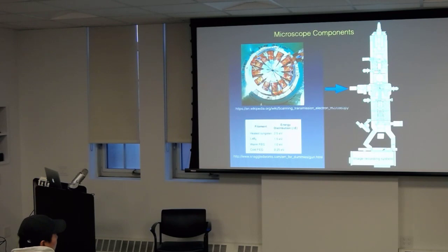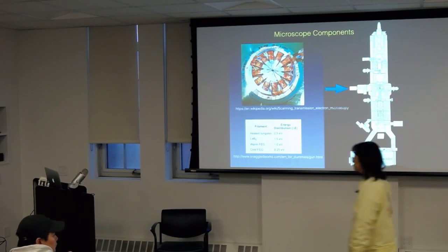Remember that I said that it will always have some sort of aperture with some lens, so that there are tiny little lens in there. It is not always shown here, but you have an aperture, you have another aperture, so your condenser system, you may have a series of that to give you the best result. And then the last part over here will be your intermediate lens, your projection system, all those parts will be down here. Then at the very end is where you record the images. Okay?